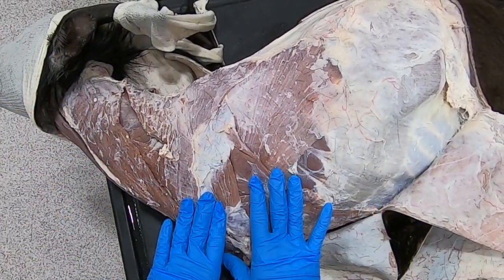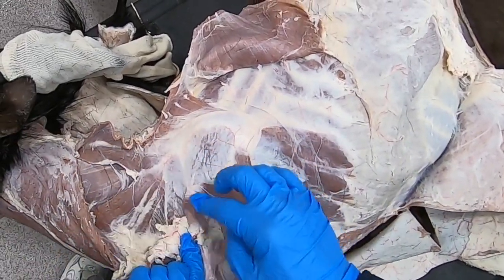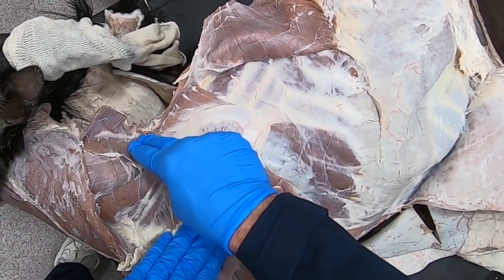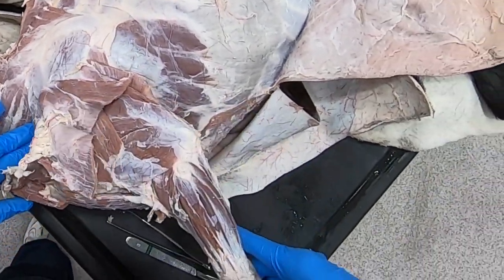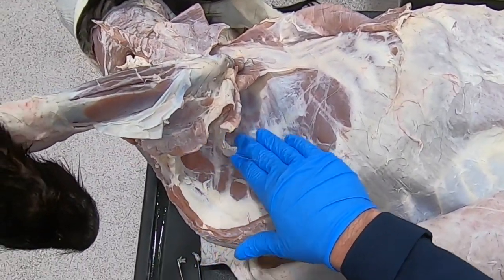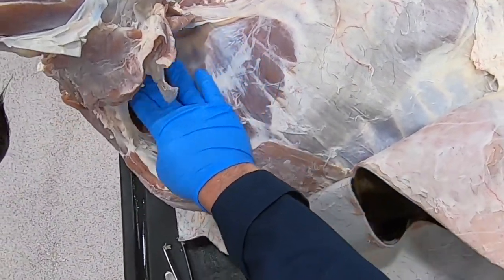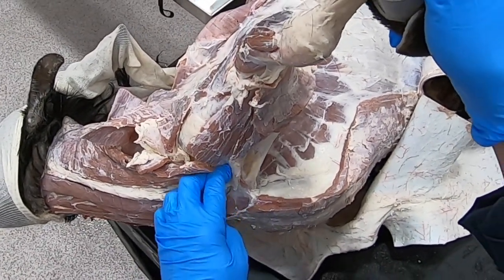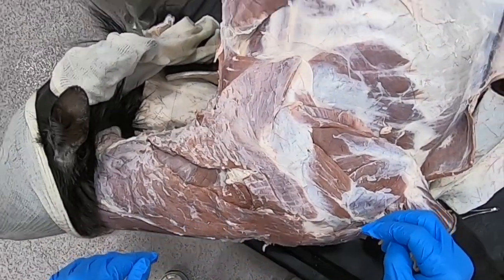Before we take this limb totally off I want to show you a few things. Here we see nicely the rhomboideus muscle; here we see the serratus ventralis — the cervical portion here — and we can look under here and see that continue as the thoracic portion of the serratus ventralis. Then in this cluster here is going to be our nerves and vessels going to the limb.